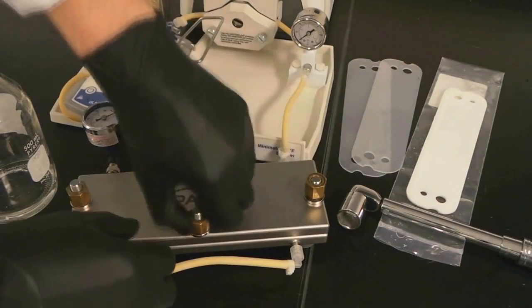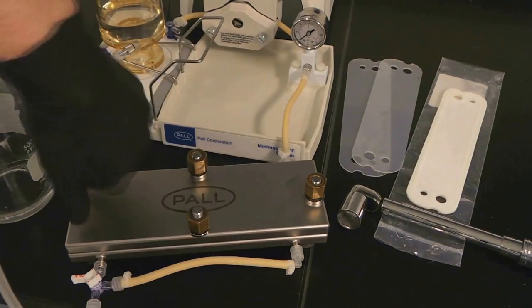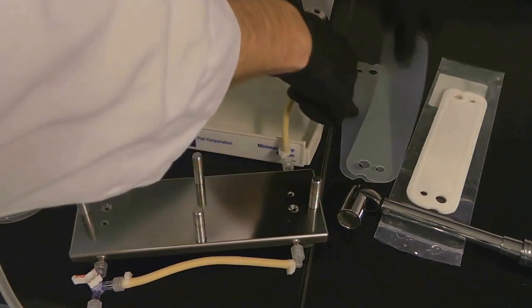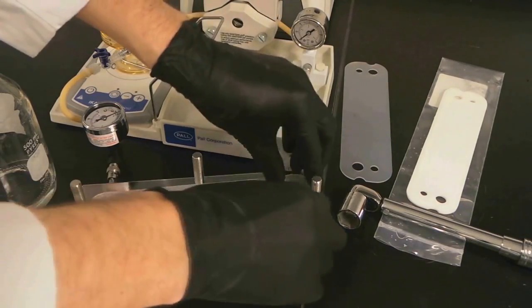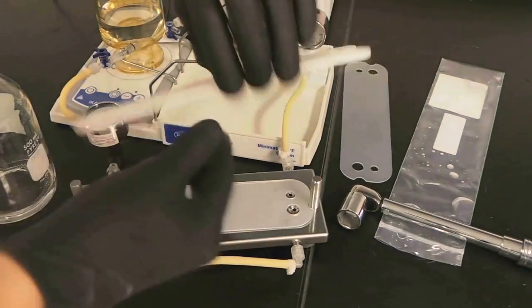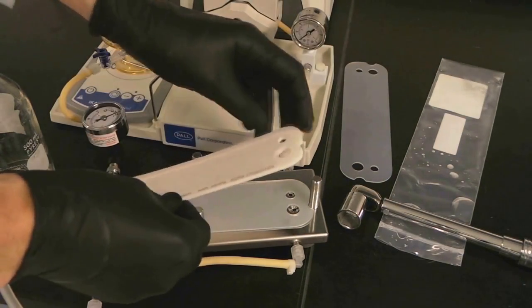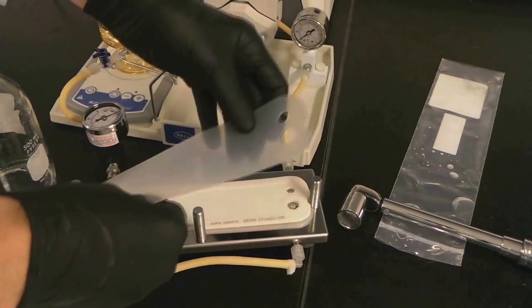To install a cartridge into the LV Centramate, start by removing all the screws and washers, then remove the top of the holder. Line up a silicone gasket and put it in place. Then, insert the cartridge, followed by the second gasket.